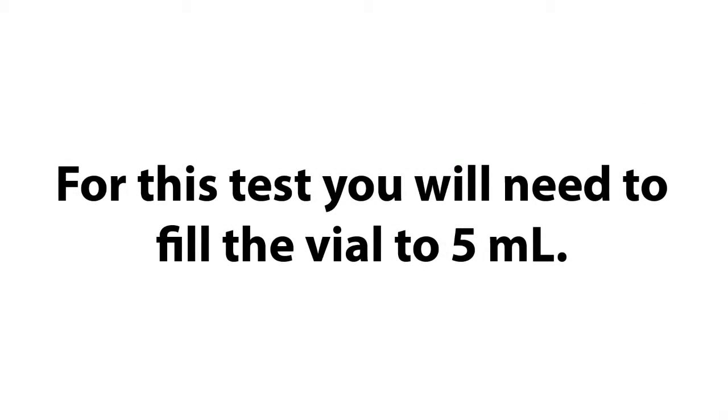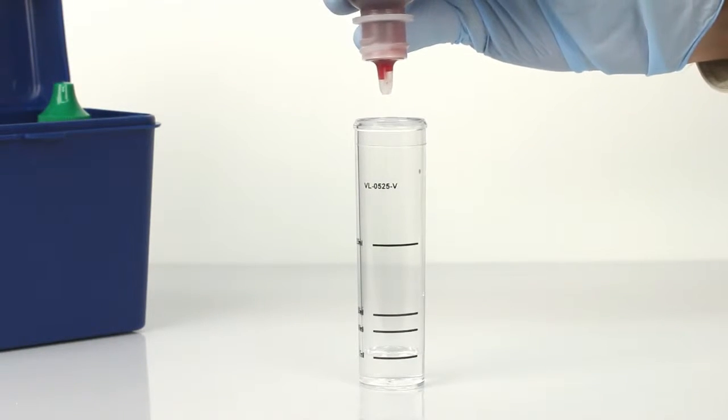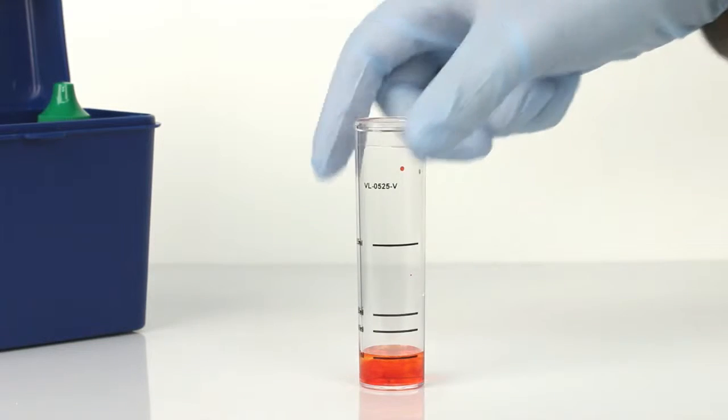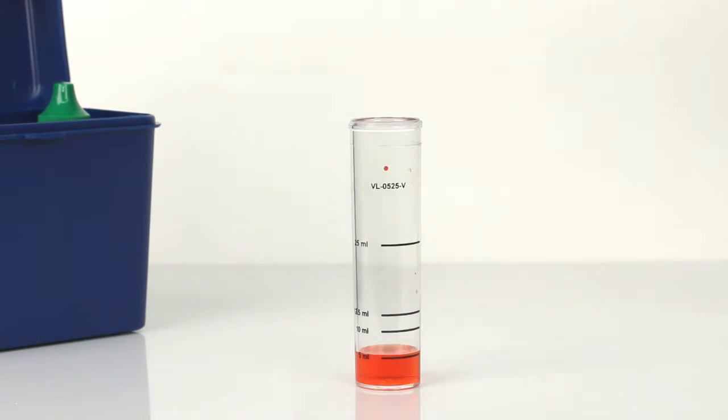The next step is to add four drops of ferroin indicator. The bottle contains a dropper tip, so it's important to hold the bottle vertically to get a consistent drop size. Swirl the vial to mix the reagents. The sample should turn orange.